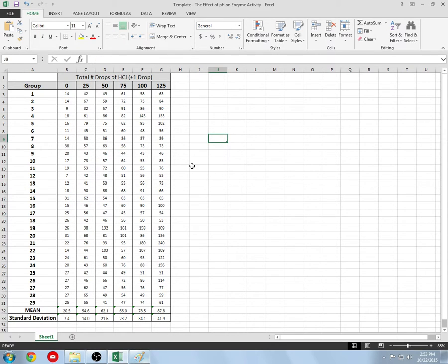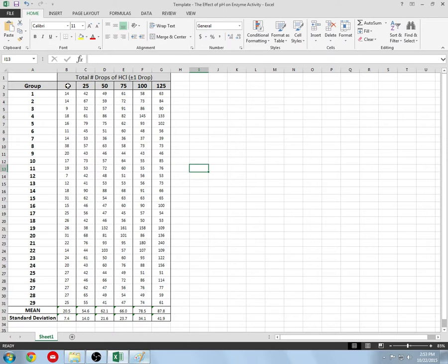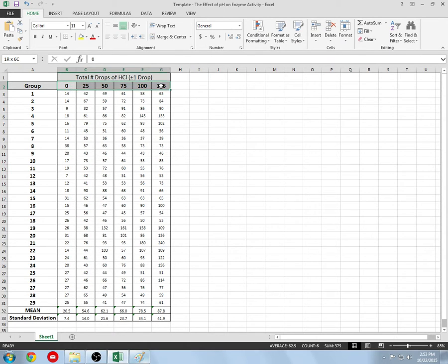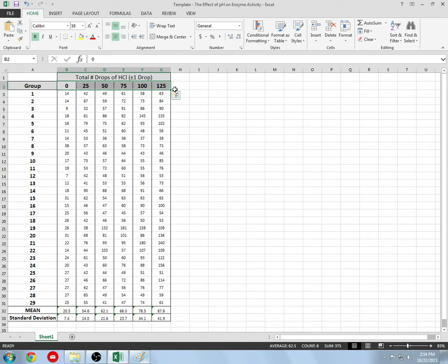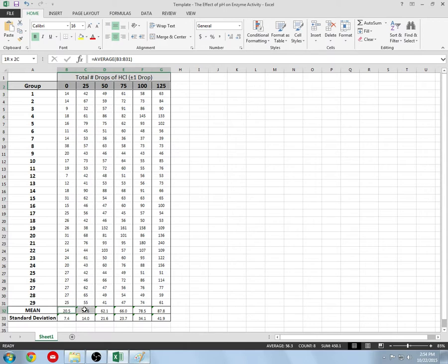Let's go ahead and make that graph. To do the graph we need to identify our x and y axis. Here's our x-axis: click on the number of drops of hydrochloric acid. That is our x-axis. We want the mean as our y-axis. Click control and highlight your mean, and now you can let go of control. I have my x and y axis.